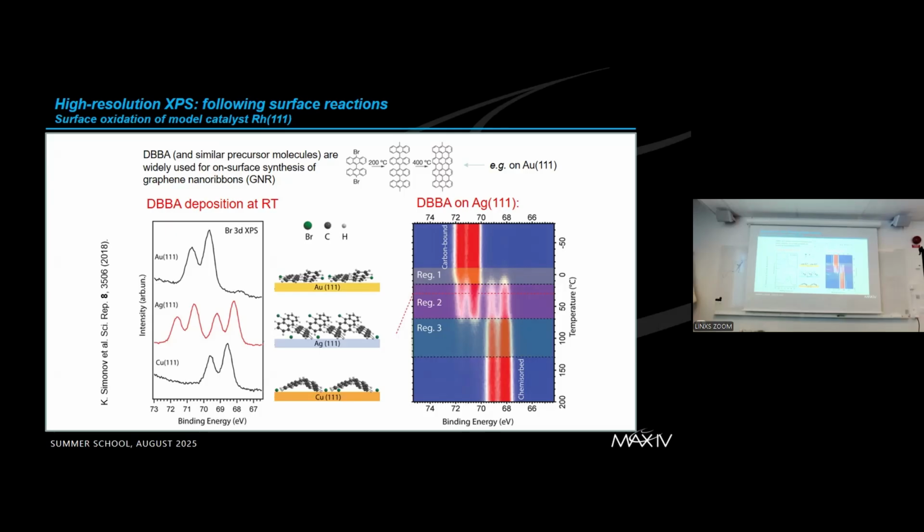So Gaussian is probably less strict than the Lorentzian, I would say. So I would always start with finding out what the expected intrinsic broadening of my spectrum is. But there is no algorithm: do this, and you will get a good fit. Fitting is special. It deserves a lecture on itself. That's why we have a special class for fitting.